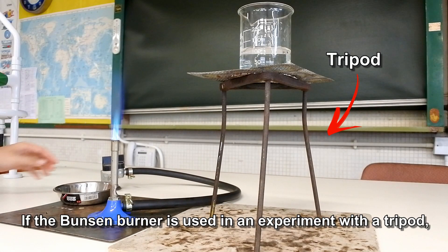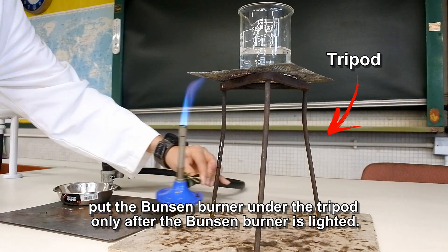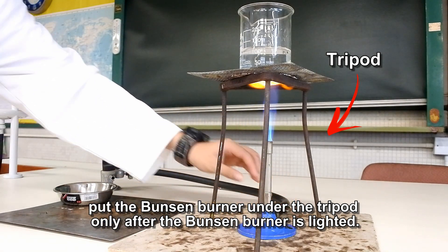If the Bunsen burner is used in an experiment with a tripod, put the Bunsen burner under the tripod only after the Bunsen burner is lighted.